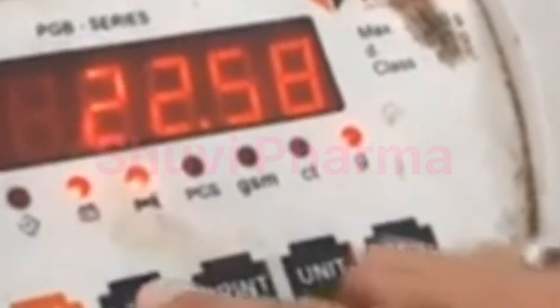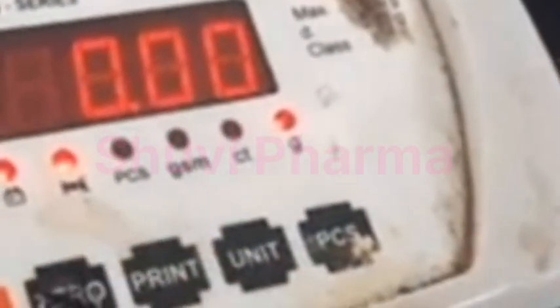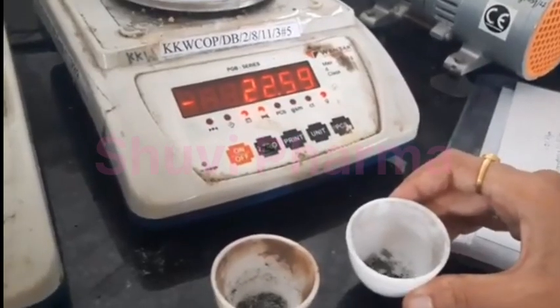Now we will weigh for acid insoluble ash. The total ash obtained is 0.16. So for acid insoluble ash we will weigh 0.08 gram. So this is for acid insoluble ash, and this we will take for water soluble ash. Now we will perform the further procedure.